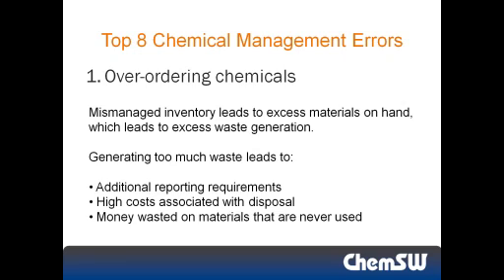A typical laboratory has thousands of chemical containers in inventory. In addition to chemicals and reagents, laboratories have things like supplies, gas cylinders, biomaterials, equipment, and instruments. Inventory material costs can be in the hundreds of thousands of dollars for research facilities.